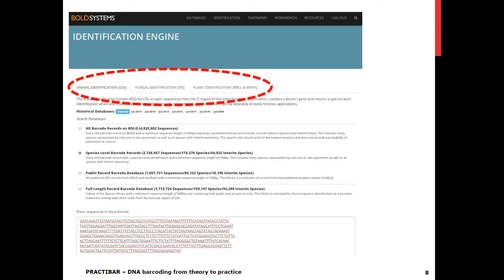So how does it work? First, choose one of the three kingdoms, then choose the database of interest — all barcode records or just the ones that have species names — and then paste your sequence into the search box and click submit. This service is available without an account, but limited to queries of one sequence at a time. With an account, it is now possible in BOLD 4 to do batch searches with hundreds of sequences at a time and receive the results through email.